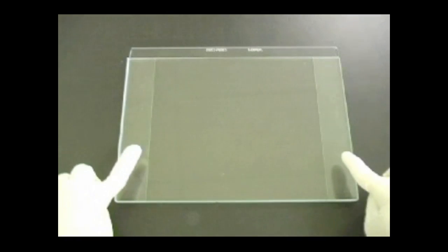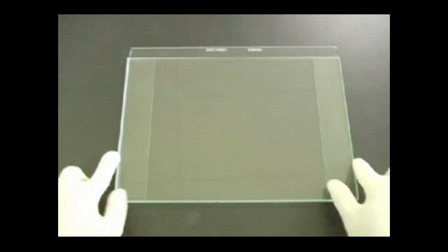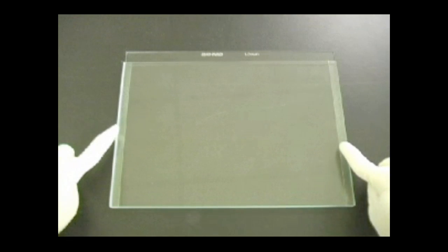Protean Plus hinged spacer plates have two widths: 20 centimeter wide to fit either 17 and 18 centimeter IPG strips, or 25 centimeter wide to fit 24 centimeter IPG strips, as well as three different gel thicknesses of 1, 1.5, and 2 millimeters.